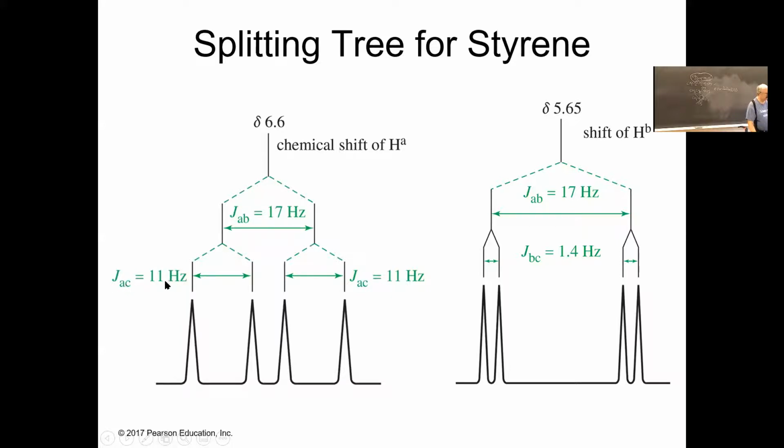The coupling between A and C is 11 hertz. So we'll see this pattern. This is not a quartet because we can see that the spacing is unequal, and also it's not a 1 to 3 to 3 to 1 ratio.